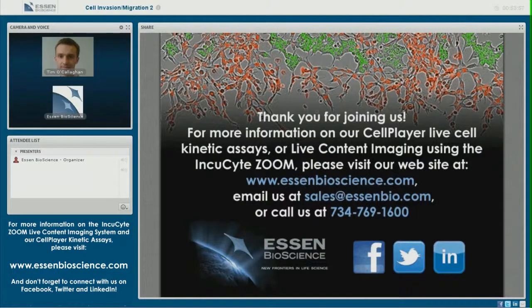We've got one or two more questions here, so thanks for continuing to ask questions. Is there a way to add chemotactic gradients to the wells? That's a fantastic question, and as with any scratch wound model of migration, this is something that we're not able to do in this model of migration.